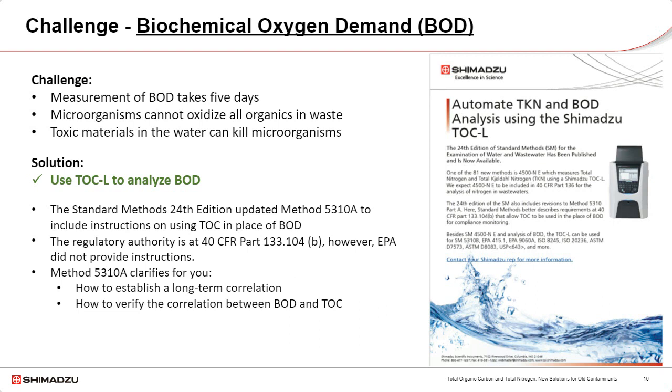So many labs, even today, are still required to measure and report BOD, or biochemical oxygen demand. BOD values indicate the amount of oxygen needed for biological decomposition of organic compounds dissolved in water. It is commonly used for the evaluation of treatment processes and the assessment of pollution load to a receiving body of water. Now, this presents many problems because the BOD test takes 5 days. Many times labs don't have 5 days to wait for results.